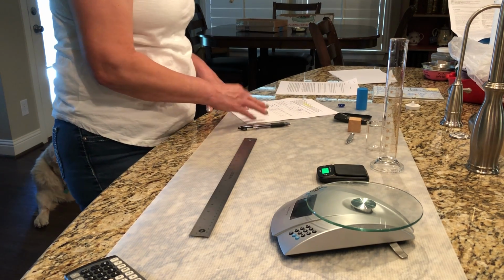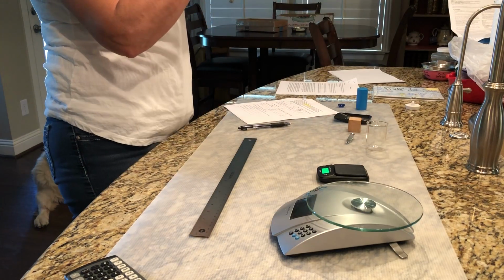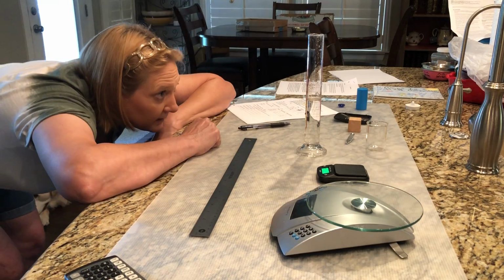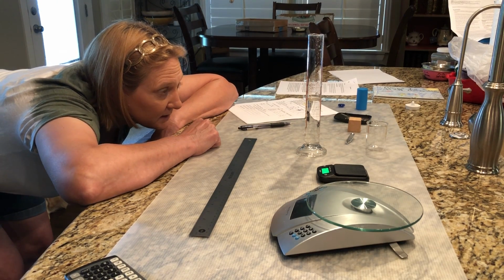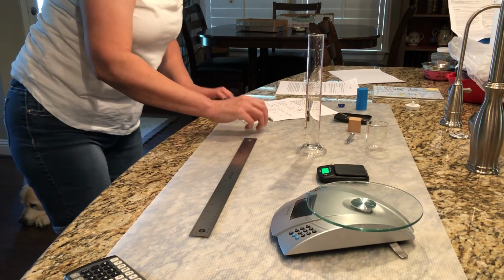So initial volume of water. Put some water in my cylinder. All right. And my initial volume is 61 milliliters.